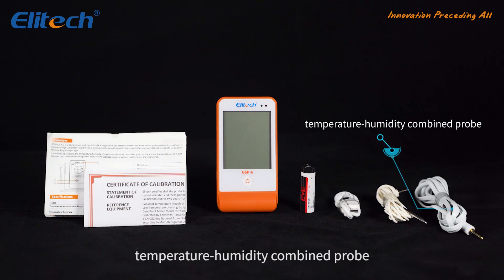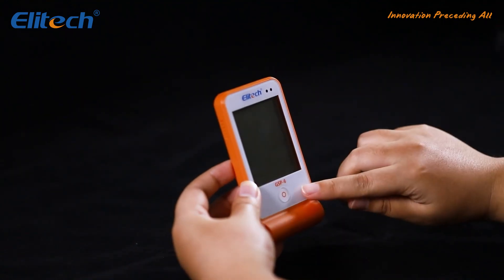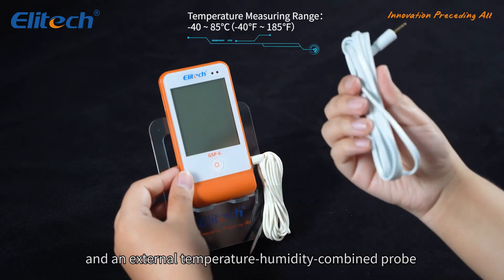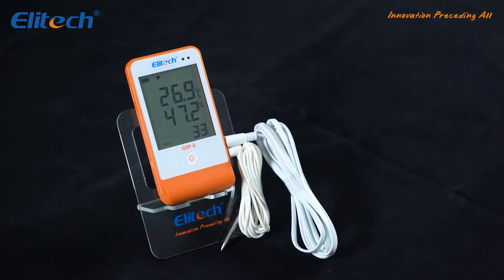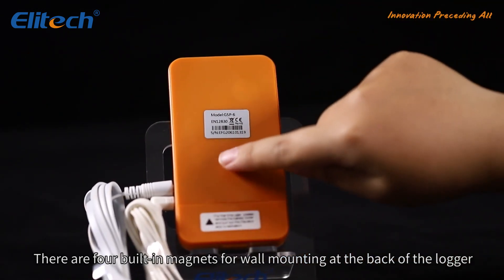Also included are a temperature probe and a temperature/humidity combined probe. This logger features a large LCD screen, one button for operation, an external temperature sensor, and an external temperature/humidity combined probe. There are four built-in magnets for wall mounting at the back of the logger.